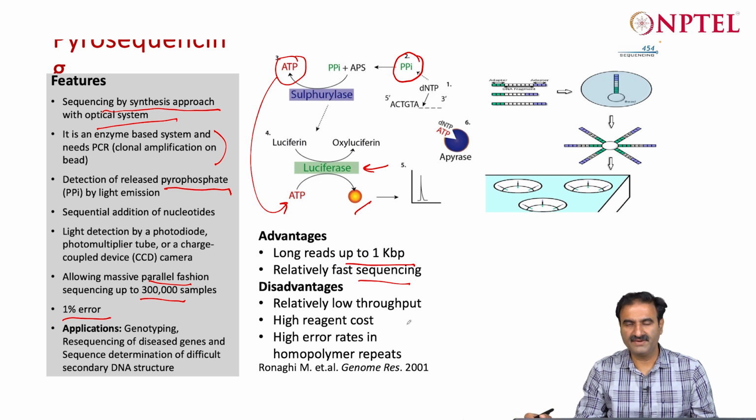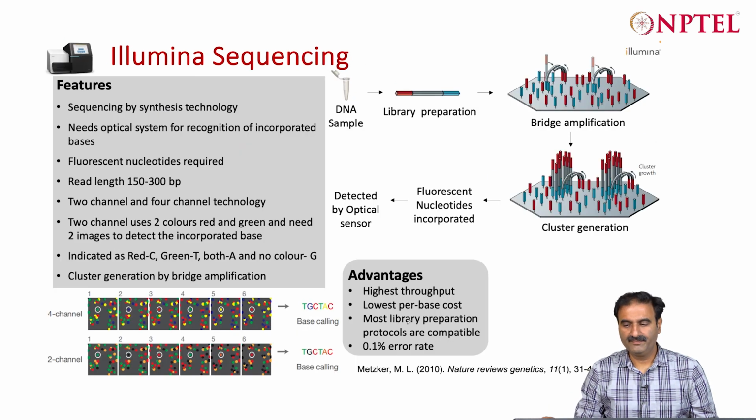you have to do washing, and that leads to wastage of reagents as well as the enzymes. So that is why this technology came after Sanger, stood there for some time, and later on, now it is not used.